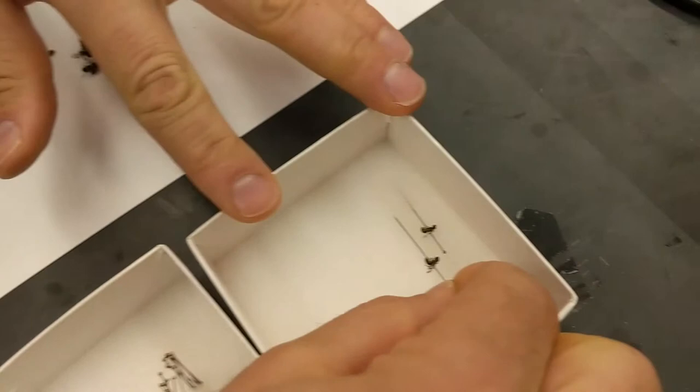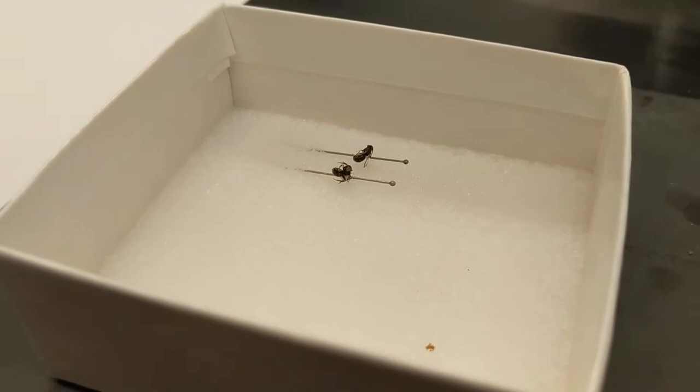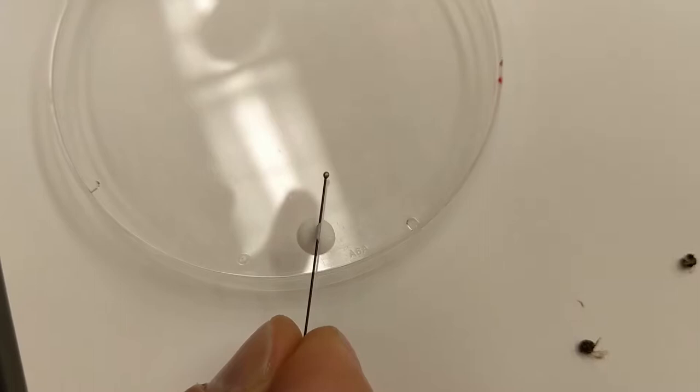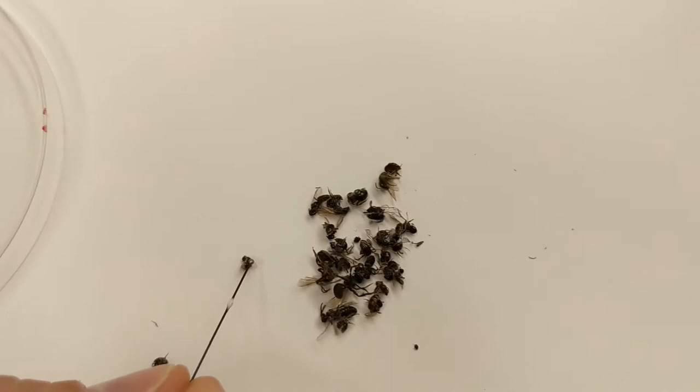I'm going to slide that in on a high angle and it'll glue in place there. You want to make sure that you roll the glue all the way around the pin. If the glue is only on one side of the pin, then when the pin flexes, the glue will pop off.